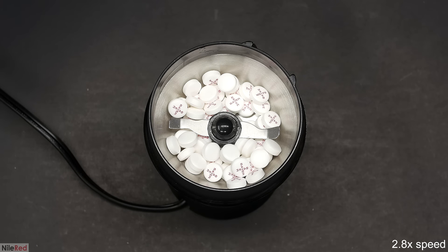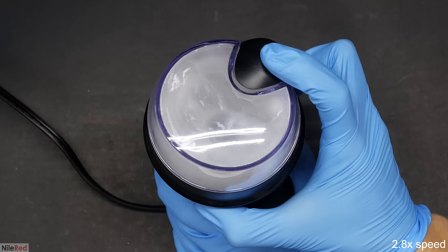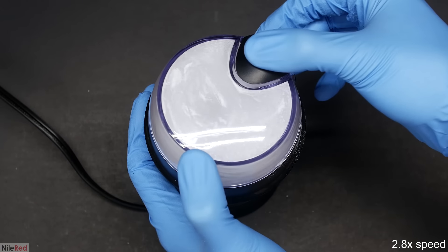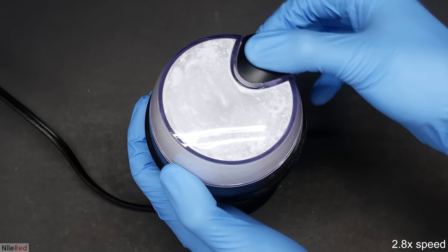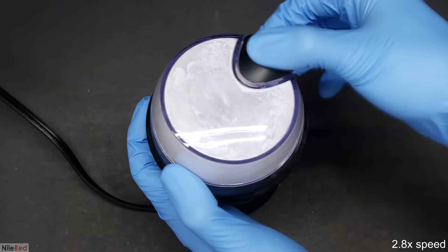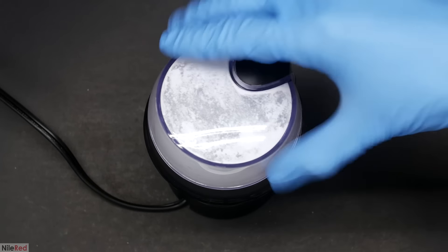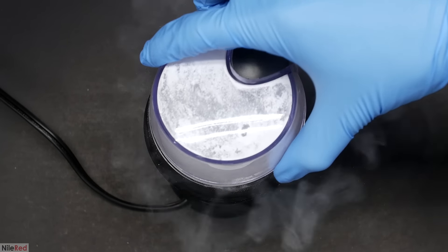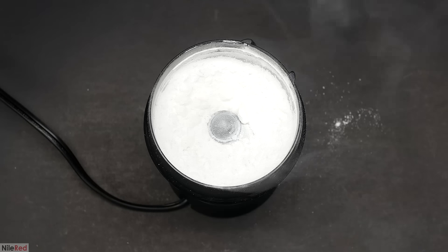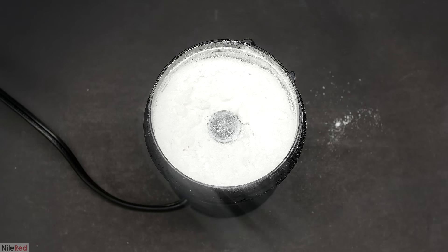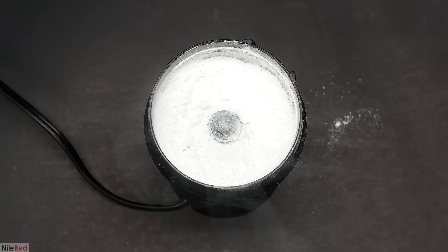To get things started, I need to powderize all of the pills, and to do this, I use a coffee grinder. Of course I could have also just smashed them with a hammer or something, but it's just a lot easier this way. When it's done, I take off the lid, and you can see a whole bunch of powder shoot out. It's important to avoid breathing this, because it's really not healthy for your lungs.